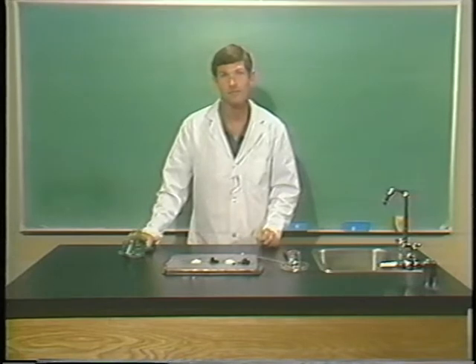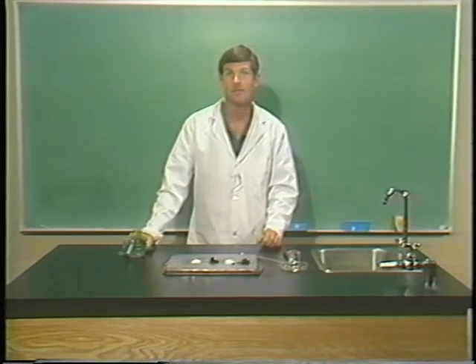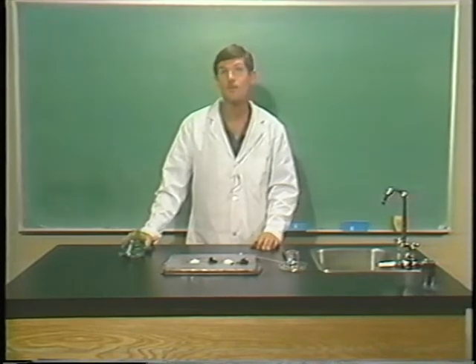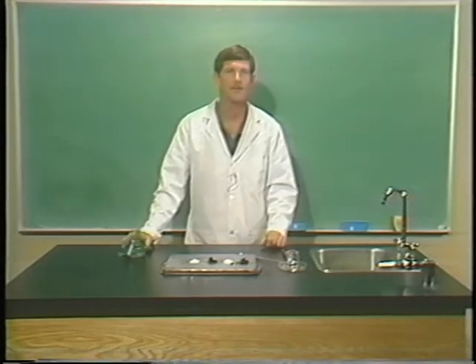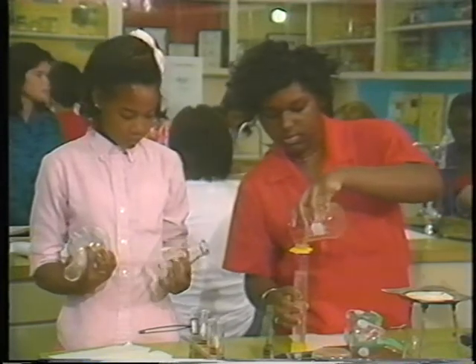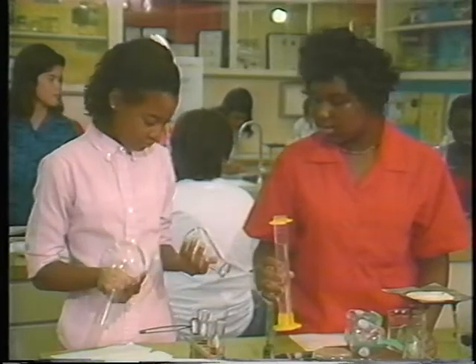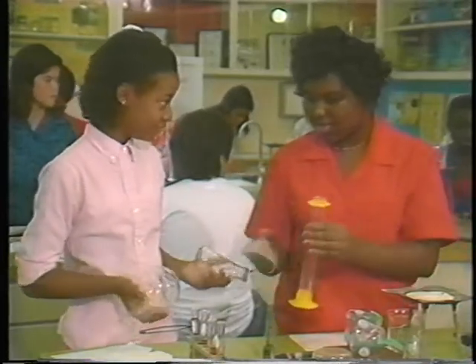And another important thing is that when you're doing a science experiment with unpredictable results, such as we have here, it's very important to start with small amounts of chemical to see what's going to happen. Imagine what might have happened if we used two or three times as much of that white powder. It's also important to know the name and the proper use of each piece of science equipment. When the directions say fill a graduated cylinder up to 50 milliliters and then transfer the liquid into an Erlenmeyer flask, what are you going to do? You've got to know what it is and what it's used for. We're going to take some time in this next section to review the different pieces of equipment and their functions.